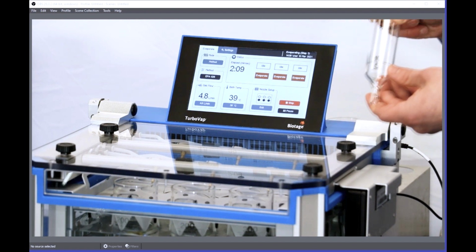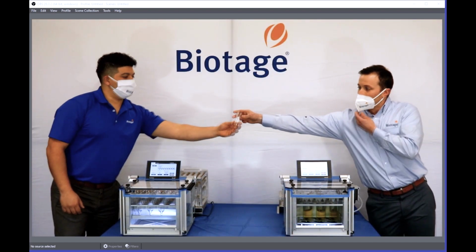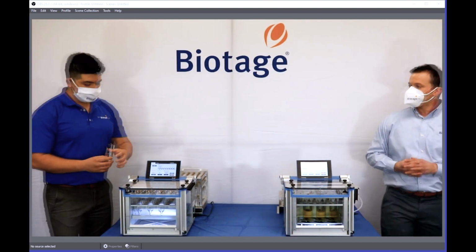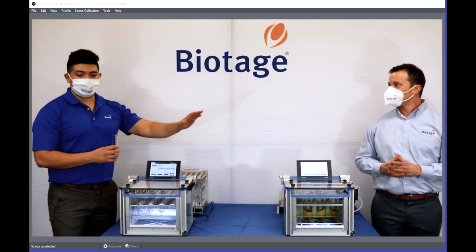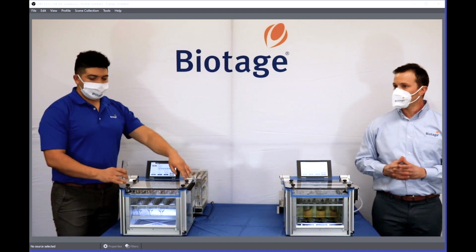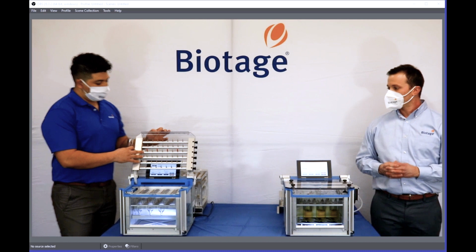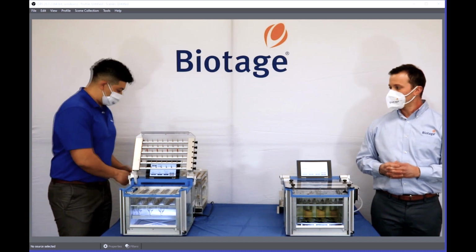And I'm going to pass this off to Mario and let him show you the LV system. Thanks, Evan. So as he mentioned, the transition between the TurboVap 2 and a TurboVap LV is very simple. All we're doing is swapping out the manifold here to our standard LV manifold, which is a 40-position manifold.